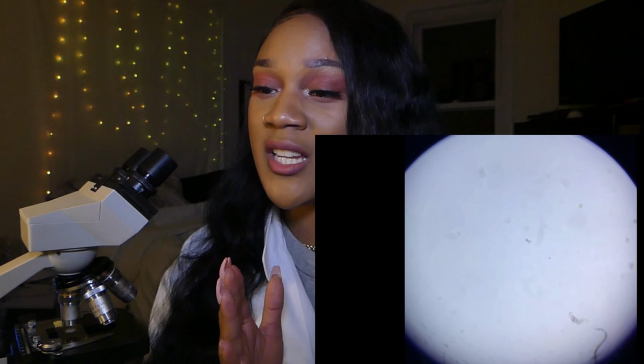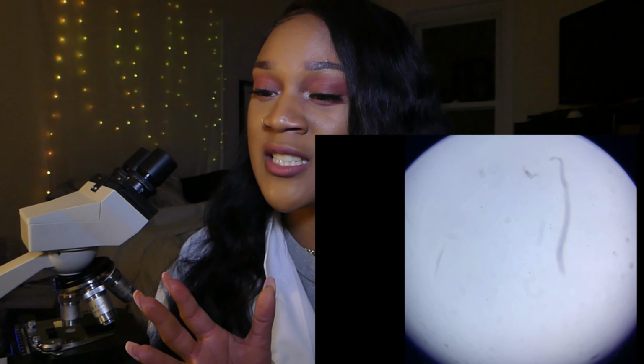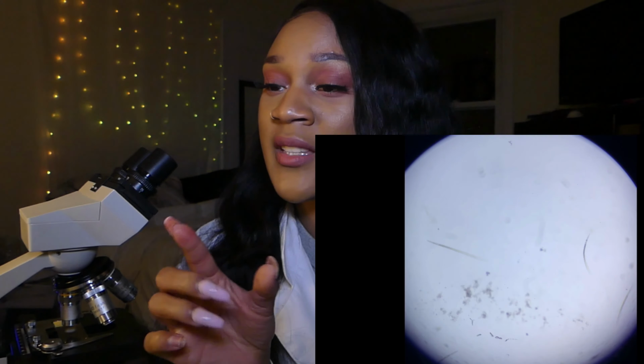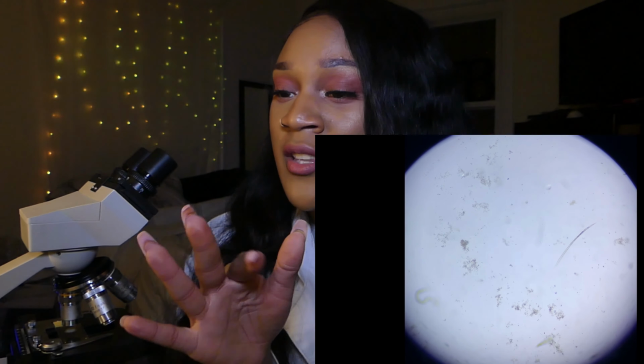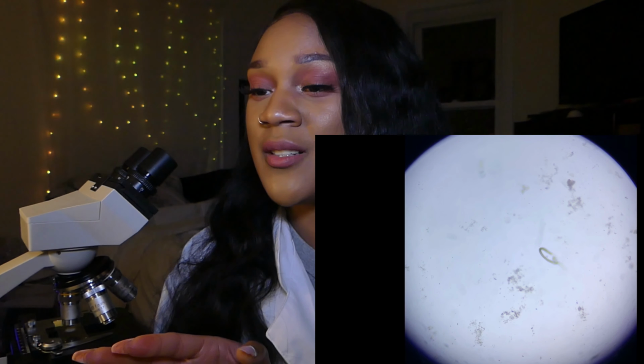Instead of moving like a little worm, or like the nematodes that they are, and curling, they were just straight. I'm looking around for some. Some are curling, some I'm trying to clean up. But these straight ones here, you can see that they're dead. This large one here is dying. All these straight little strings, those are dead vinegar eels.